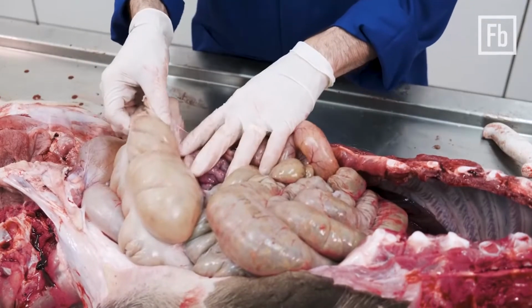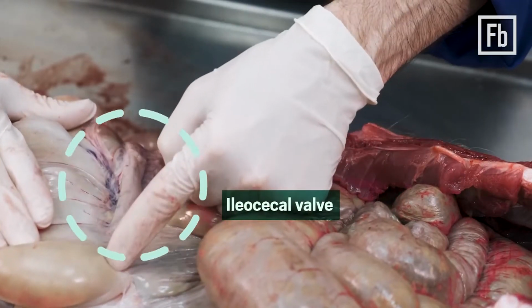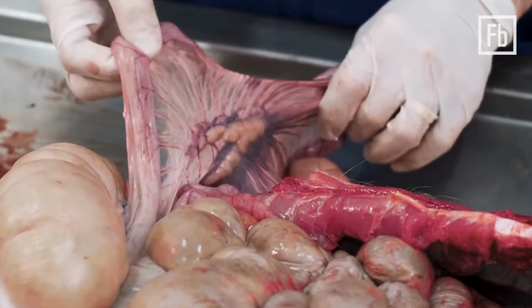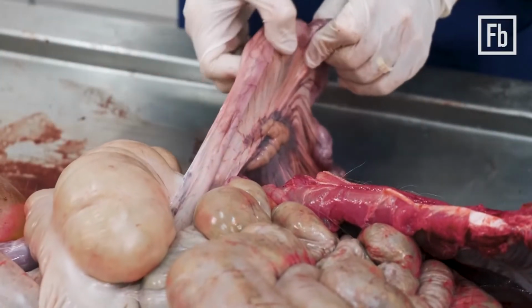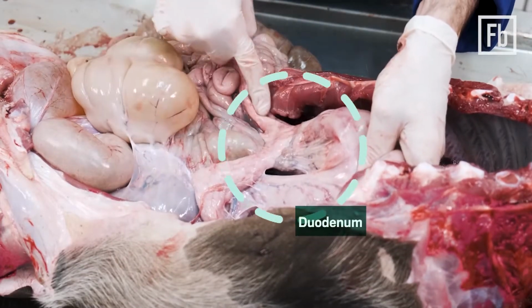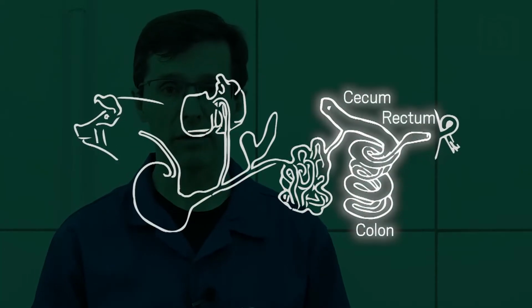Once the cecum is located, the ileocecal valve is identified, which is the passage from the small intestine to the large intestine. Starting from the cecum, moving back up the small intestine, the first approximately 80 centimeters make up the ileum, where it is possible to more easily observe the Peyer's patches, which are lymphoid tissue and an important part of the immune system. Above the ileum we have the jejunum, the longest part of the intestine, about 12 meters in length. Above the jejunum, comprising the first 80 centimeters of the small intestine from the stomach, we have the duodenum, which is connected to the pancreas. Comprising the large intestine after the cecum, we have the spiral colon, which leads the feces to the rectum.